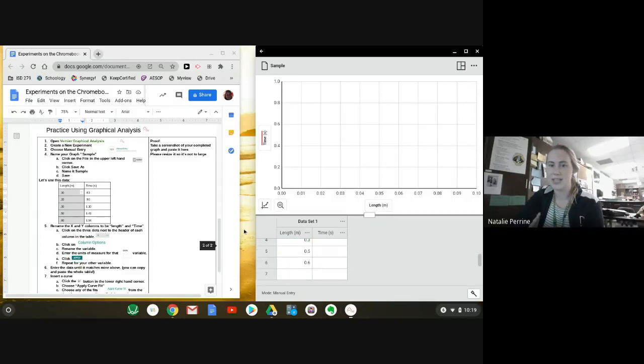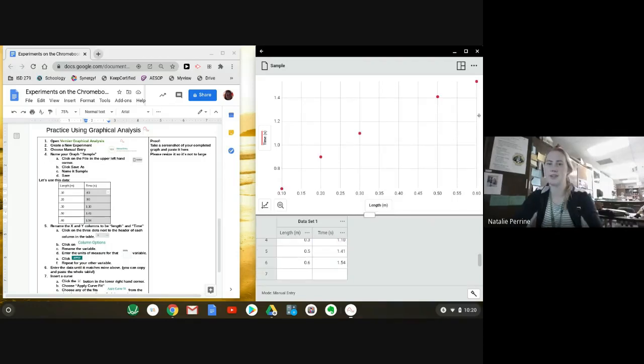It actually takes a second, so let it load. But you can do 1 column at a time. Do not try and do both, or it will not work. And so sometimes you have to press it twice, but there's all 5 data points. That's the benefit of working with groups, is if you have a data table, you can copy and paste.